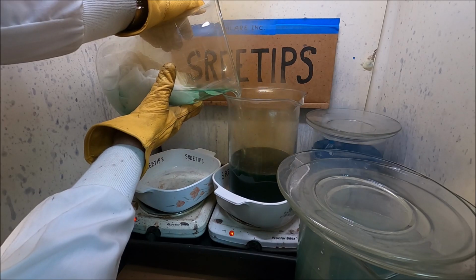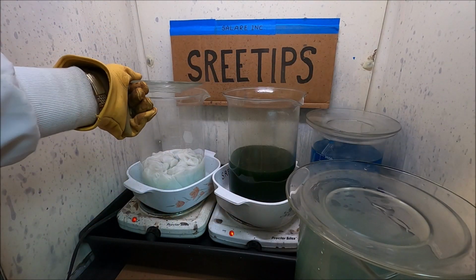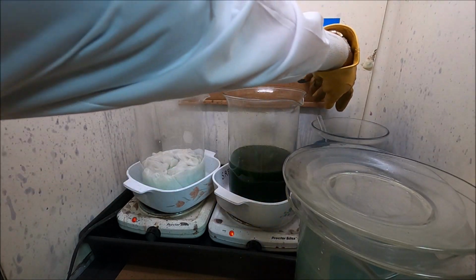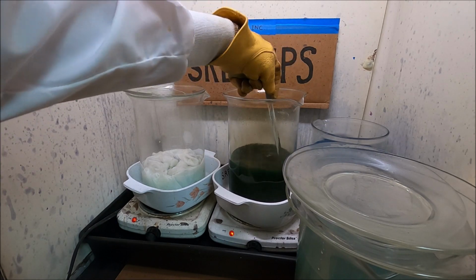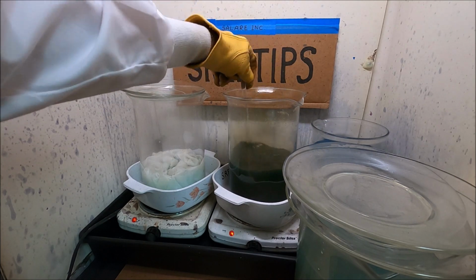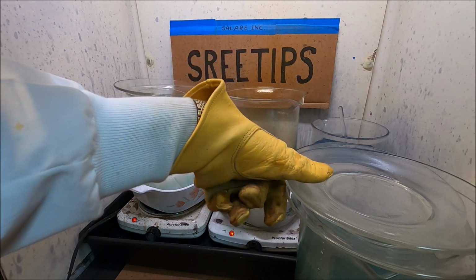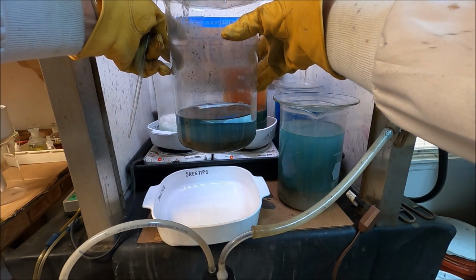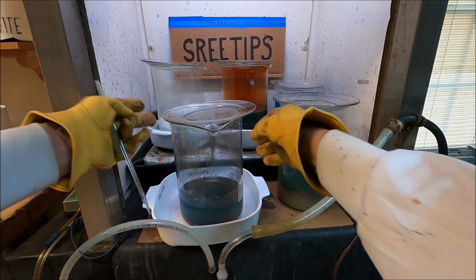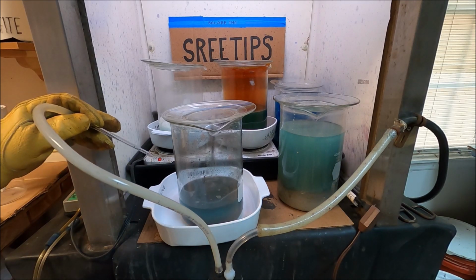This is hot dilute nitric from our filters here. Give this a stir. I've got some solution in here, and what I'm going to do is draw this off with a fine tipped tube here and get the rest of this solution out of our solids here in this beaker.